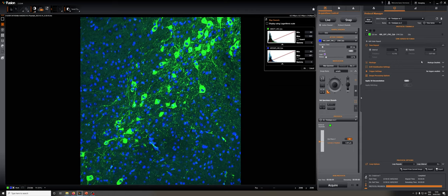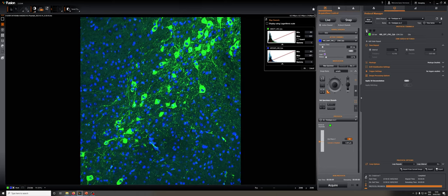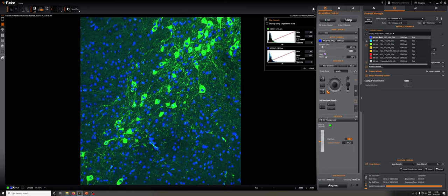And if I hit acquire it will do that for the channels I have selected, in this case that is just the GFP, so let me add the DAPI again.